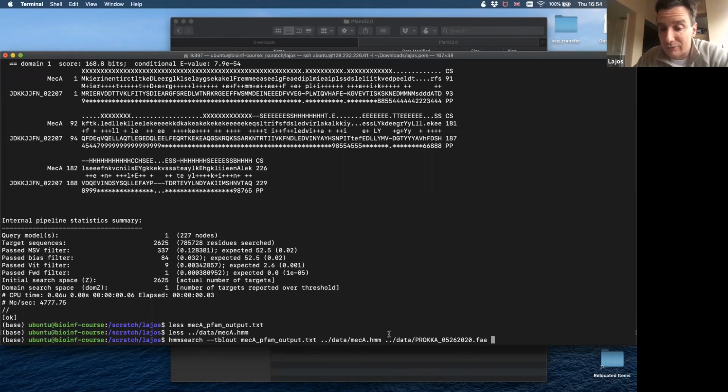So it's very flexible. It's also true for BLAST. You can BLAST a single sequence against a single contig, but you can also BLAST multiple contigs against multiple contigs or multiple genomes.